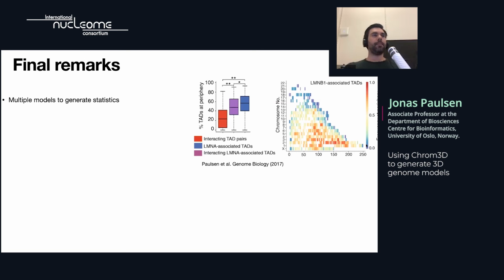Yes, as I already mentioned, there is a full genome version of this INC tutorial that you can access. Here, if you just go to github.com/chrom3d, you will see today's tutorial, but also a tutorial called INC tutorial full genome that you can try out to generate a full genome model.